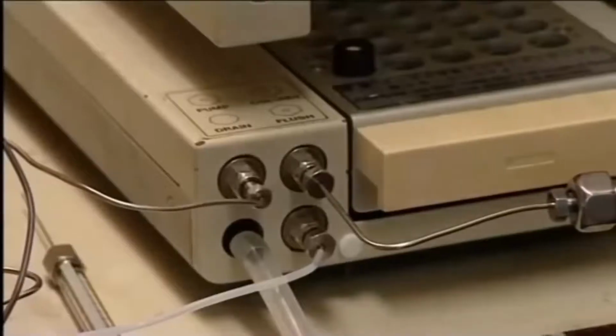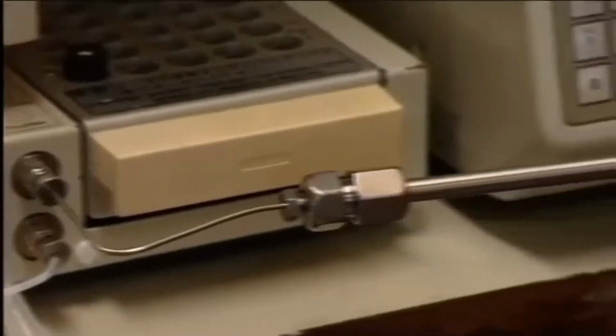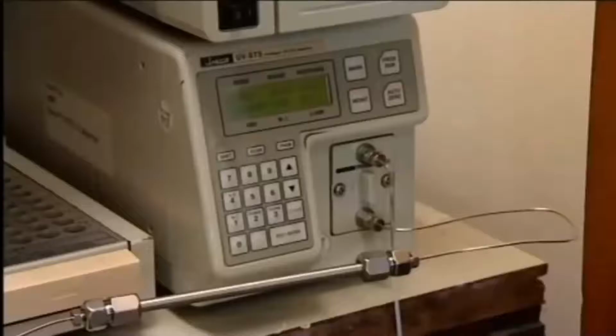The pumps force the mixed solvents through the column. The solvent emerging from the column and carrying the separated components of the mixture passes into the detector. Here, a beam of ultraviolet light shines through it. This light is set at a wavelength that is absorbed by all the components to be separated. When the detector reading drops, the component that is absorbing UV light is coming out of the column and passing through the detector.